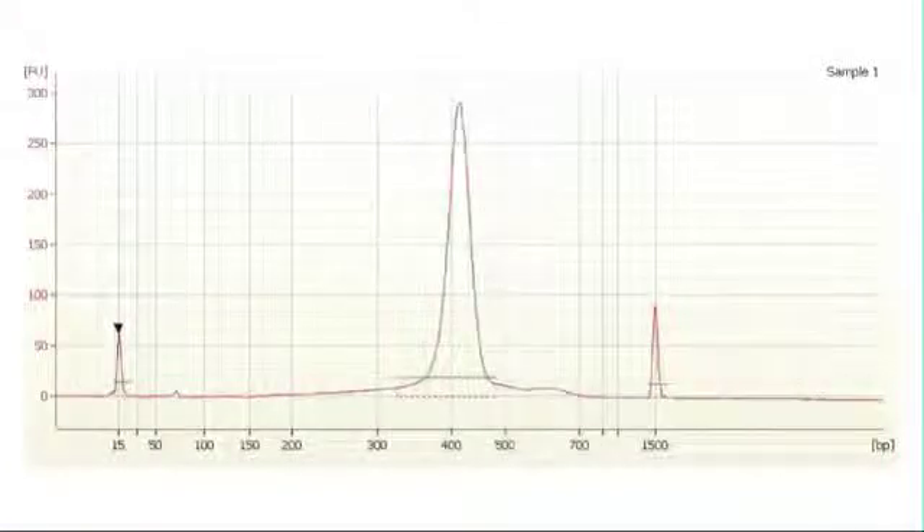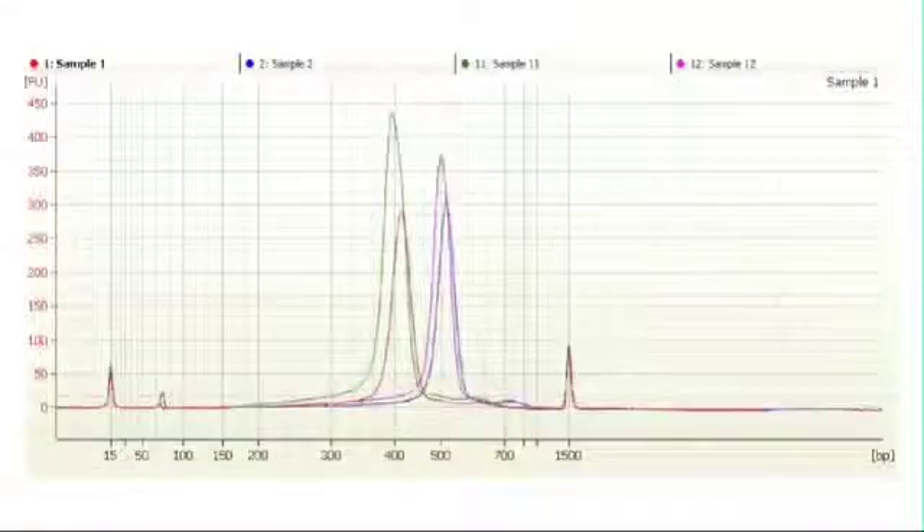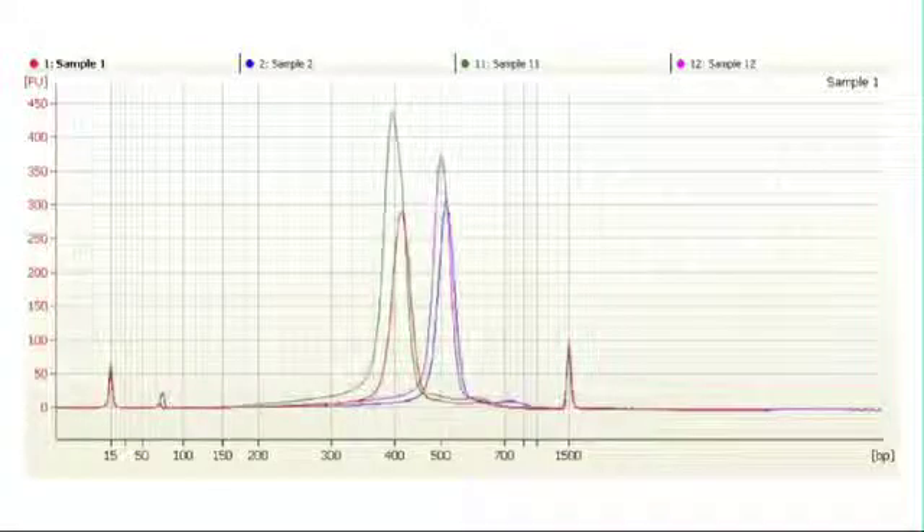Different applications require different QC sample profiles. In this example, we were making a high diversity library with 16 PCR reactions and a very tight cut. Notice that the peak is tight and tall. If we take two cuts from the sample, we would expect each sample to look like this. We use this QC step to identify process failures, start rework of those samples right away, and prevent low quality samples from getting onto the sequencer.